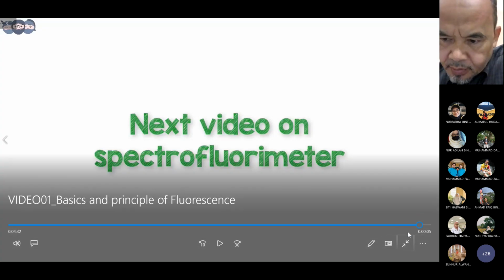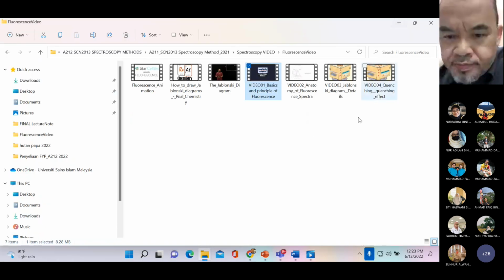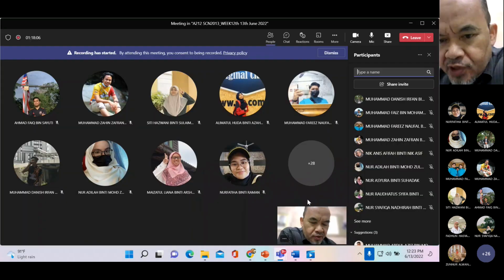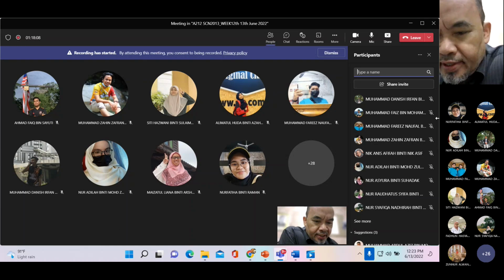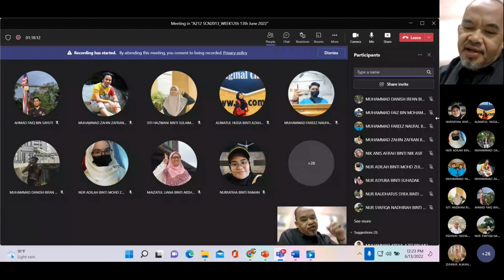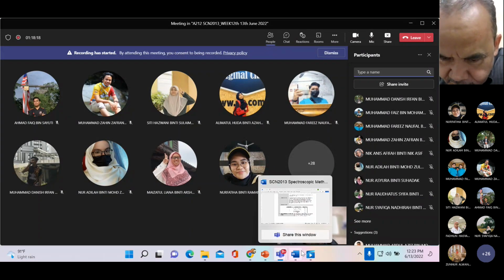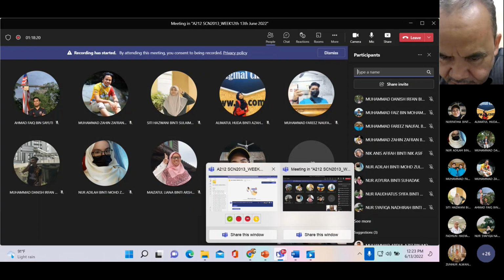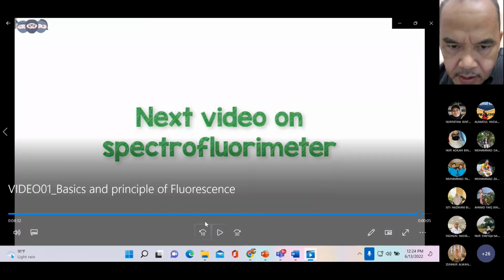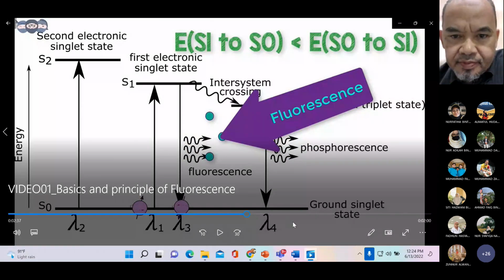Okay, basically in this video I try to discuss two things on the principle. The first one is on the Jablonski diagram, the energy diagram, and second is on the instrumentation. Maybe I just show a little bit. Okay, this is the one.